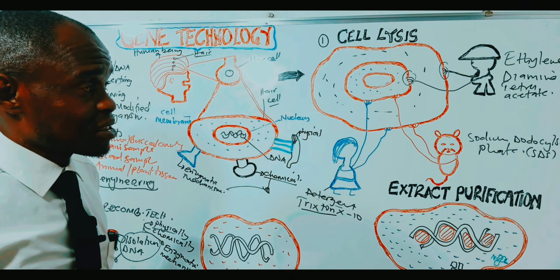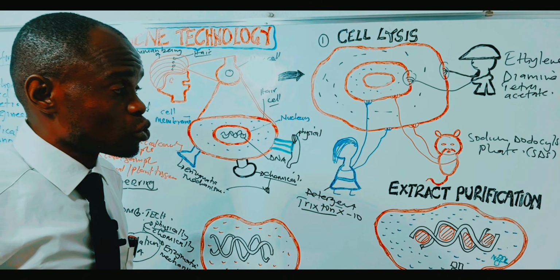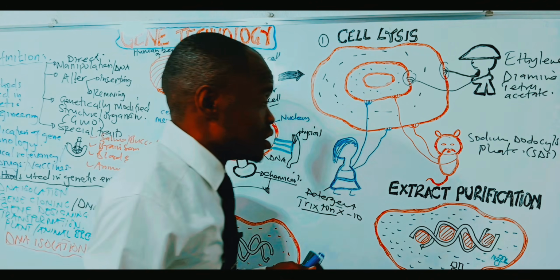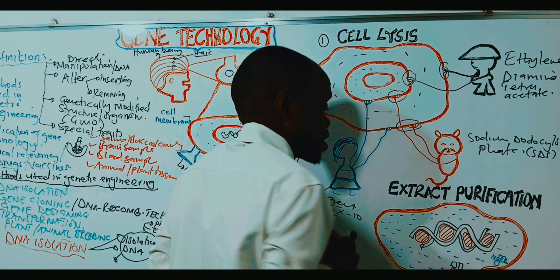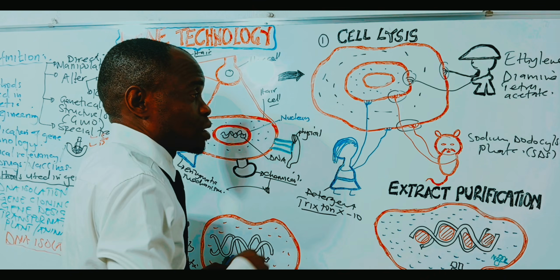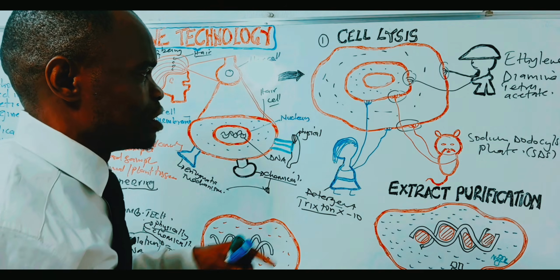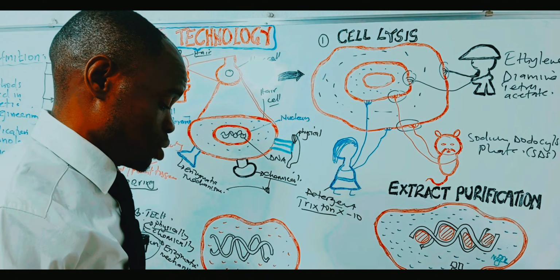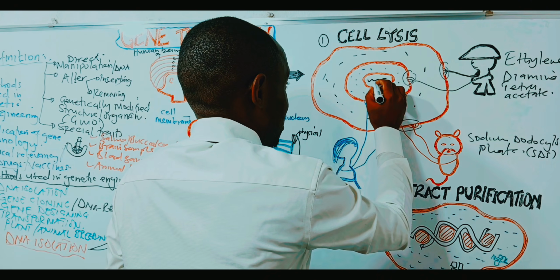That component, members, is also very important. What does it do? It is going to participate in breaking the cell component here. So most of these components, the detergent, this one like a buffer, this one also like a buffer, can deal with breaking down the cell membrane so that they can expose the components here.